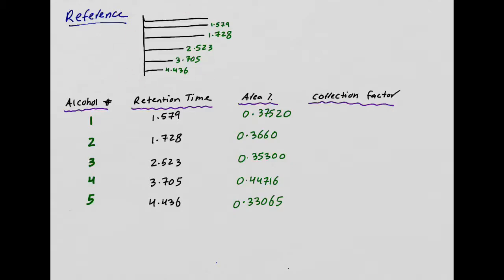When I look at this, the first thing I say is, okay, the first line, that is the solvent. I can ignore that one. After that, let's count 1, 2, 3, 4, 5. So GC shows that we had 5 compounds in this mixture. That is great because that is what I expected.